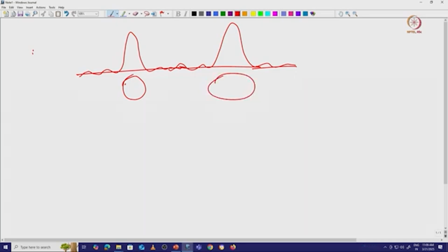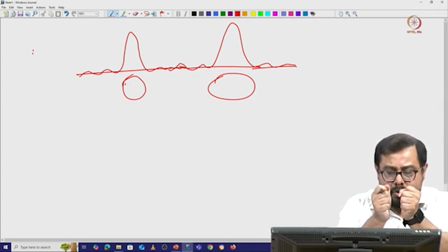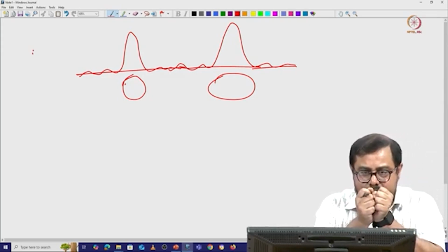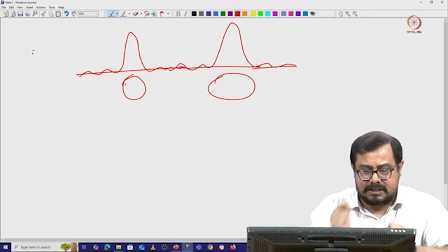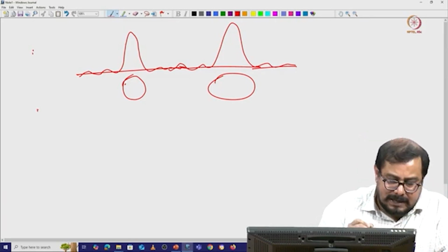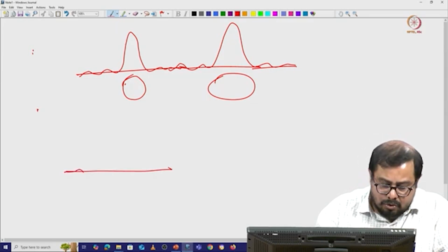So our definition-wise resolving power will be that when these two particles are very close to each other, even if there is a source of light, these two sources will be connected with each other. So if we come here, if these two points are like this, there may be three possibilities.